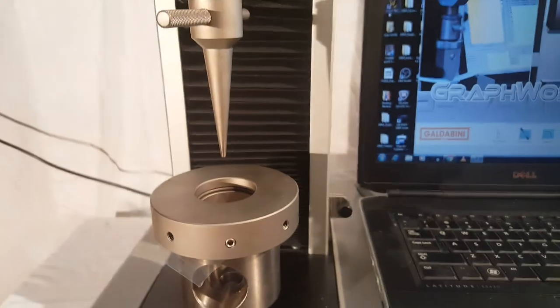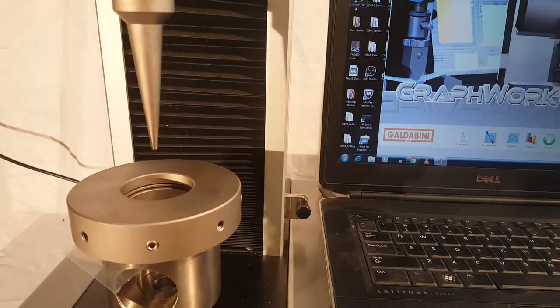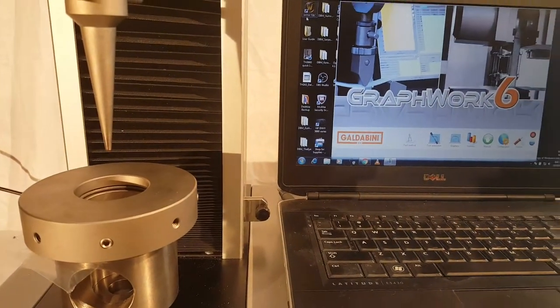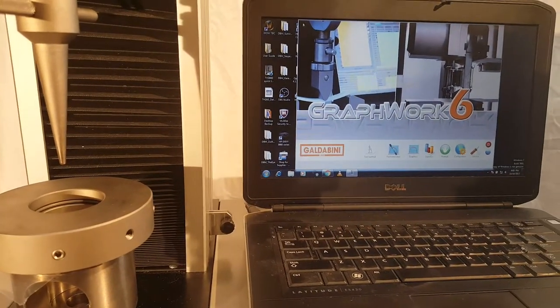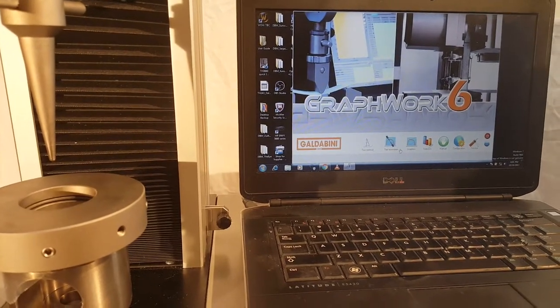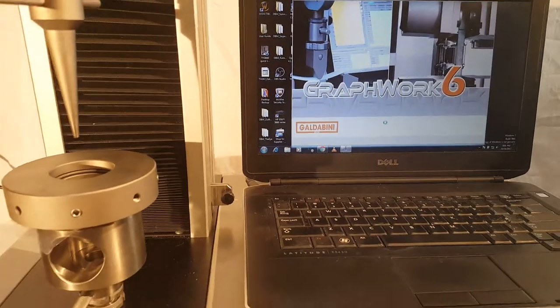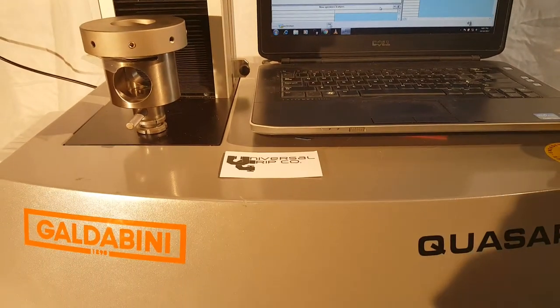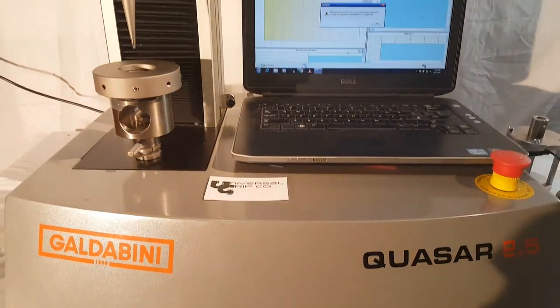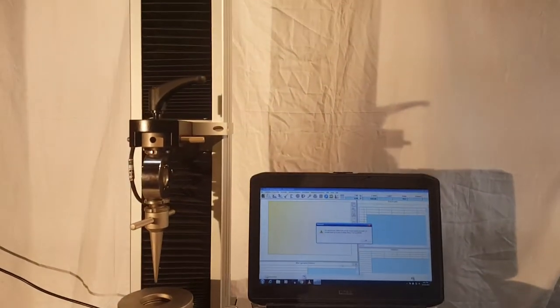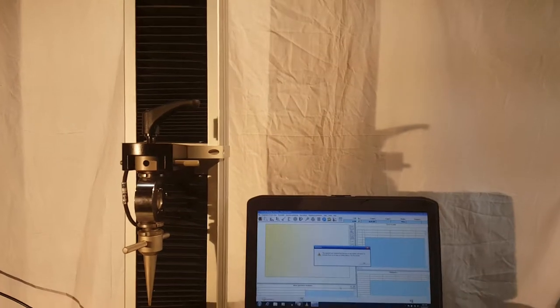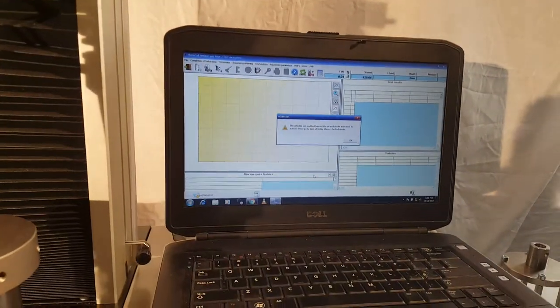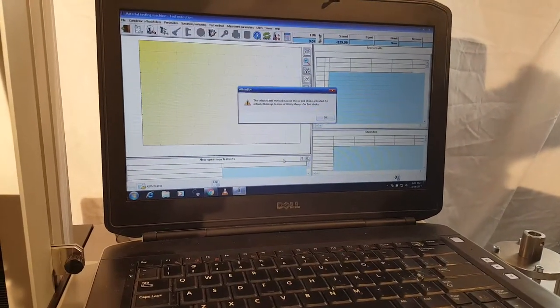This puncture nose or needle nose will come down and go through the sample. I have a test method already set up on my Galdabini machine. This is a very flexible and easy-to-use universal testing machine.